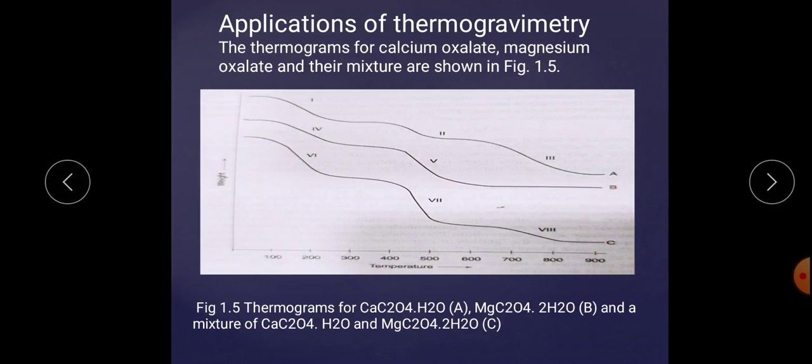We know that the magnesium oxalate dihydrate does not respond above 500 degrees Celsius. Hence above 500 degrees Celsius, from 650 up to 850 degrees Celsius, only the calcium oxalate monohydrate has reacted. Means this third curve is only because of the loss of CO2 from the calcium carbonate.